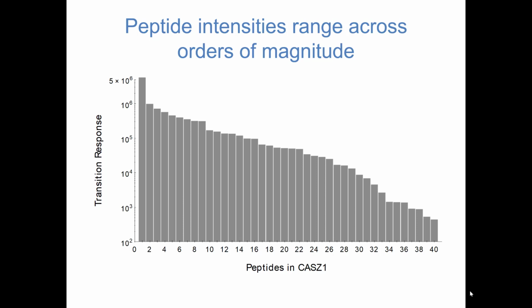We end up seeing about 3.5 orders of magnitude in dynamic range. The peptides that fly really well up here do so much better than the peptides down here. Being able to select which peptides you need to go after is pretty hard if you were trying to measure across this entire range. There's almost no way that, in a normal proteomic sample, you would be able to see the things down here, despite the fact that they have exactly the same abundance as the things up here. Could there also be digestion issues? Yes, yeah.